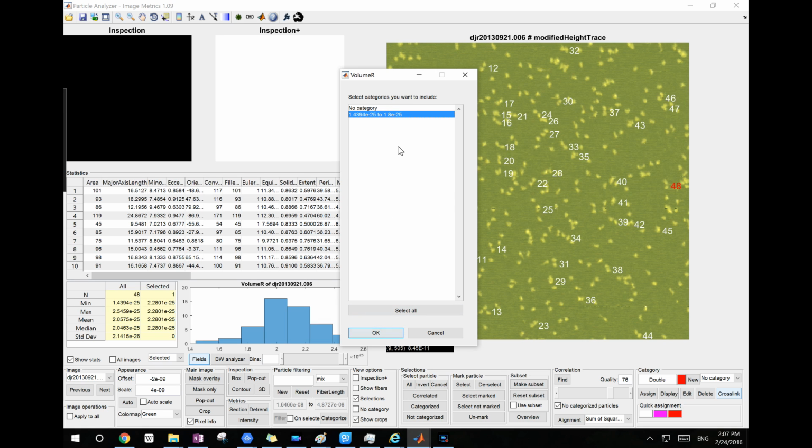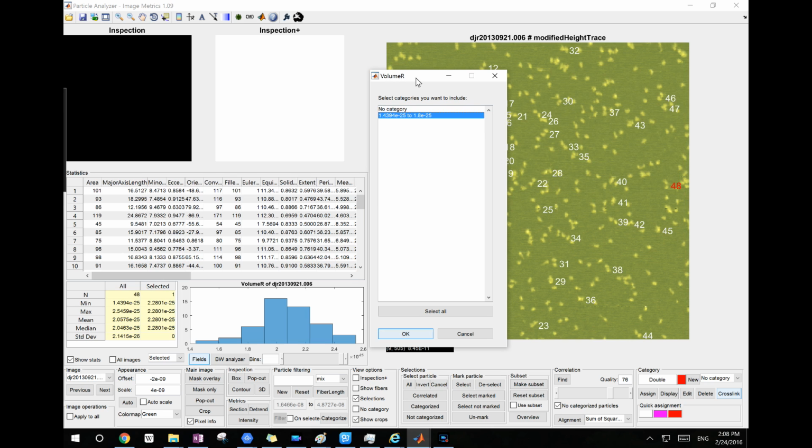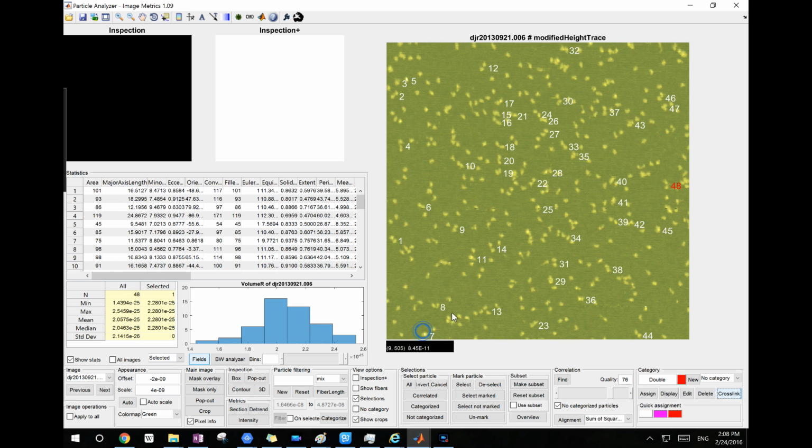So basically the crosslink will do an intersection of these three filters. But you can also select multiple categories under the same filter, and it will do a union of the selections of these multiple categories under the same filter, but an intersection of selections under different filters. I explain more of that in the actual text session of this tutorial. So right now I'm just clicking OK.